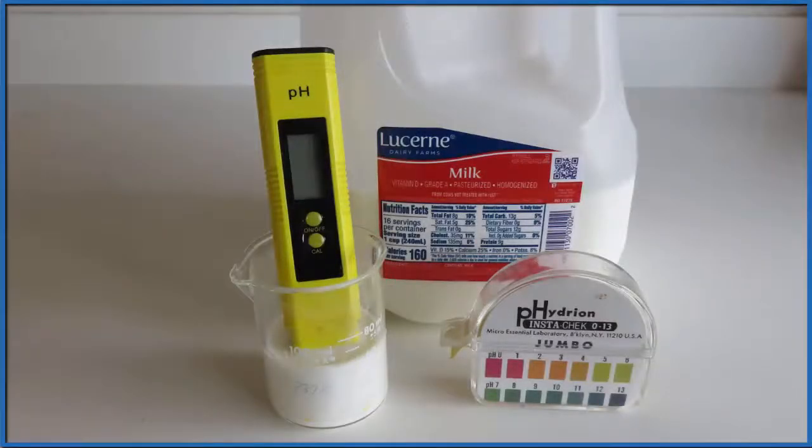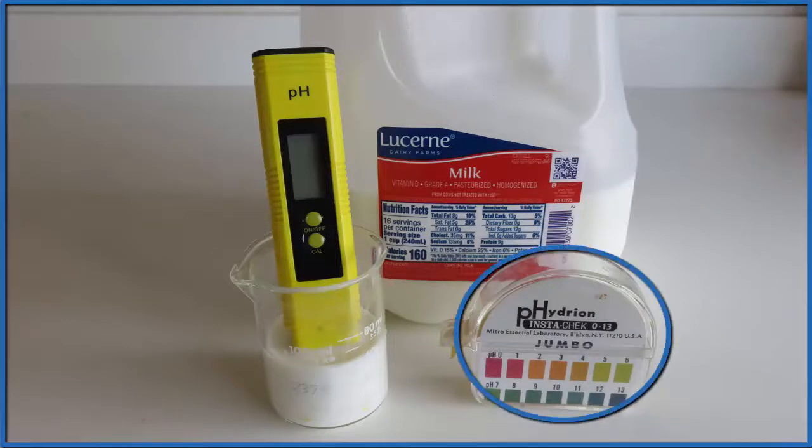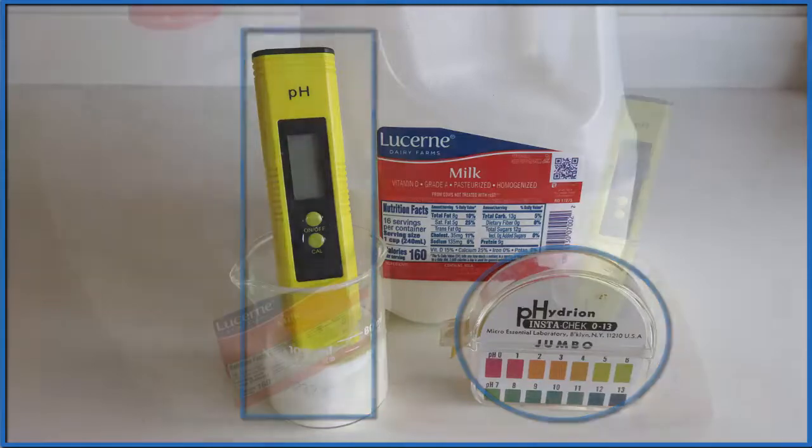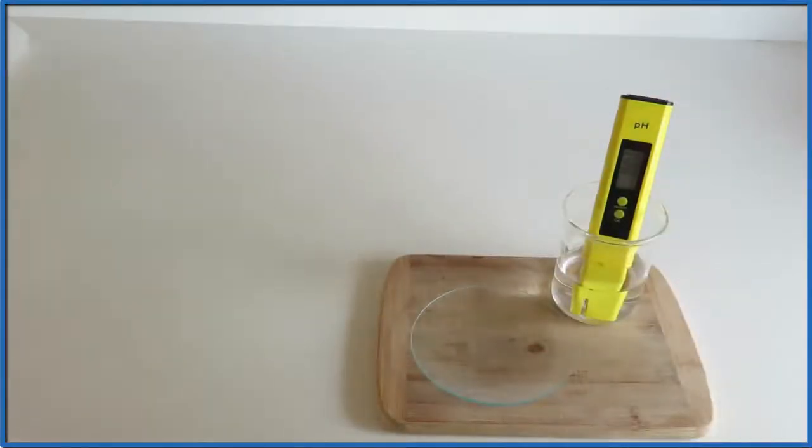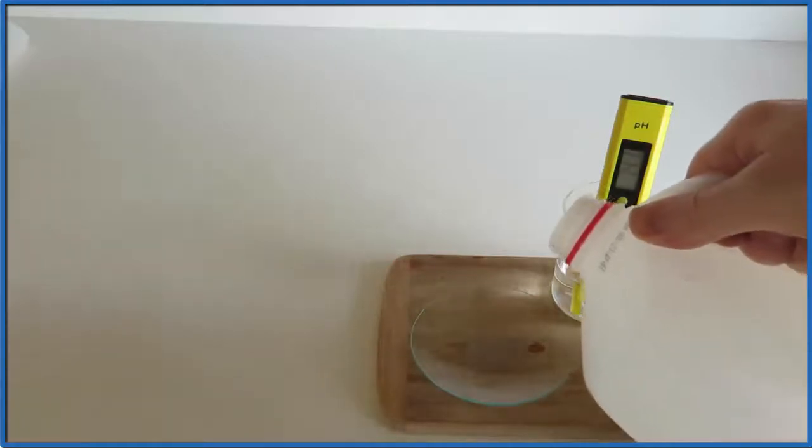Let's take a look at the pH of milk. The question is whether milk is an acid, base, or neutral. We'll look at it with pH paper and then a pH meter to get a more accurate reading. So we take some milk — this is whole milk that I got from the grocery store — and we pour it on the Petri dish.